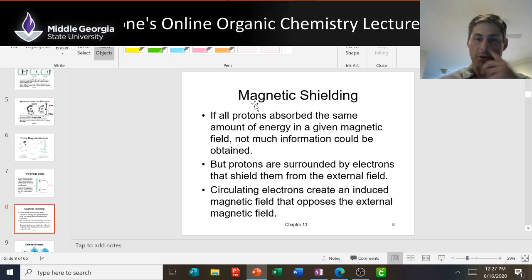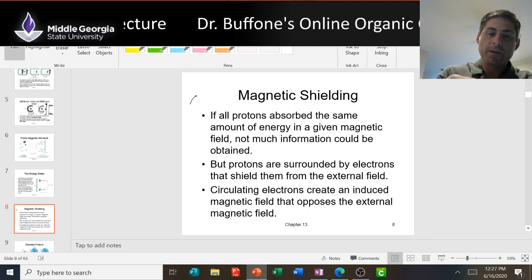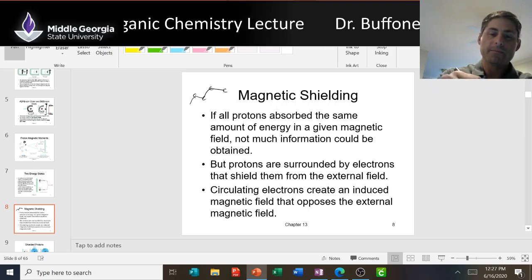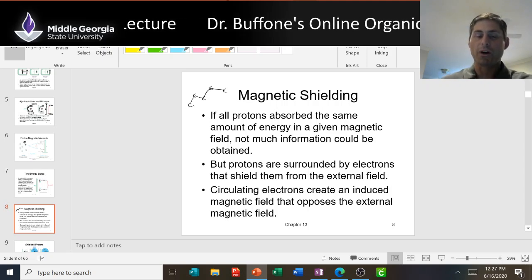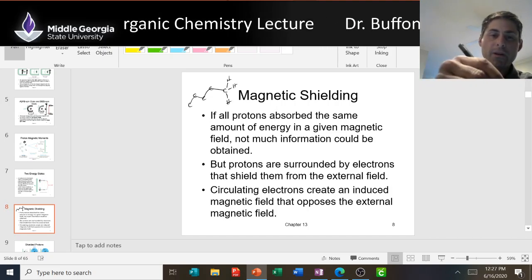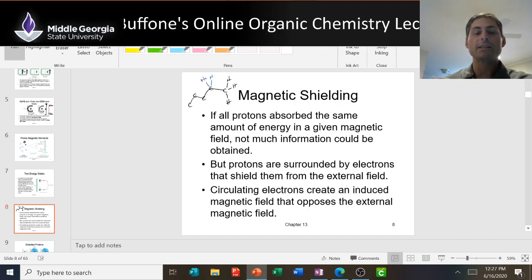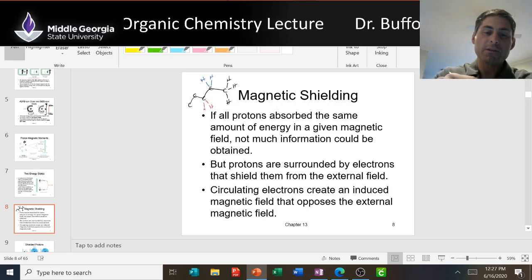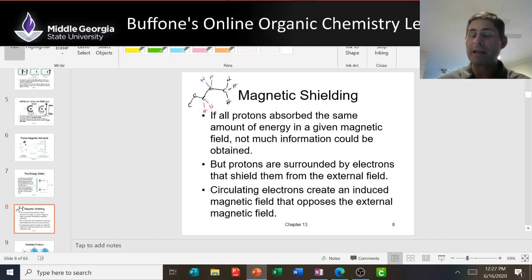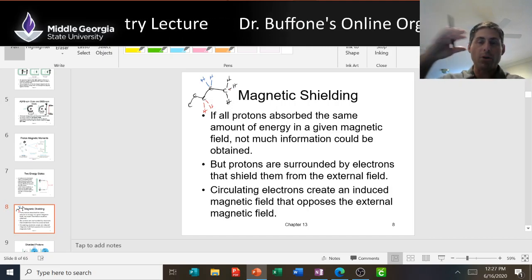If I have an organic molecule, let me see. I'm going to draw my little picture of my organic. Here are my carbons. Now check this out. Those protons in my organic, if I'm looking at proton NMR, right? These guys are going to be the ones that generate my signal. And I will get a signal for these protons. Why? I'm going to take my molecule, whatever this compound is, in this case it's pentane. I'm going to put it in a little glass tube, drop it in the NMR, which means I drop the thing into a large magnetic field.